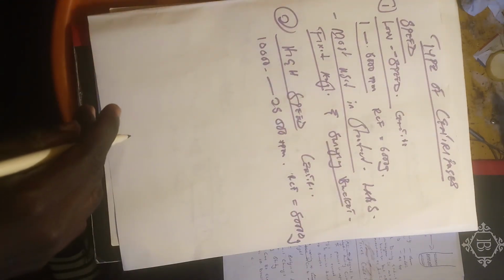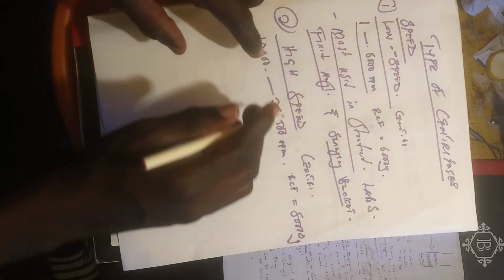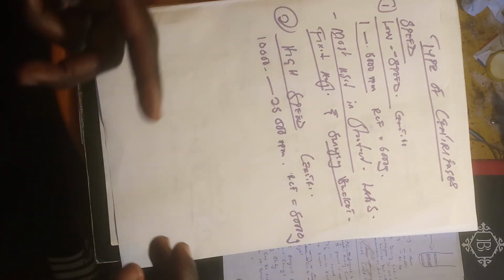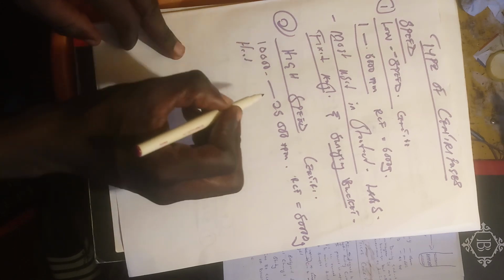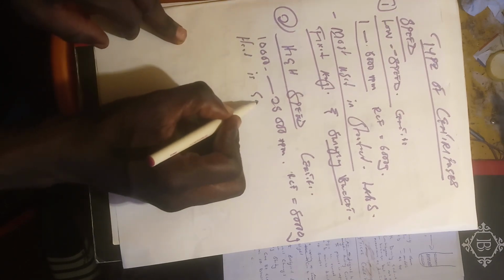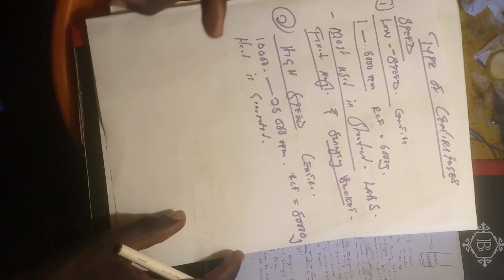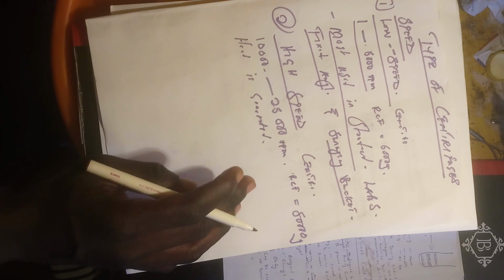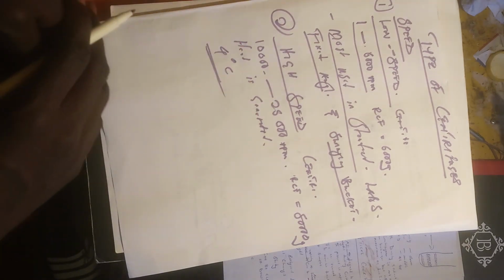Then another thing is that unlike in the low speed, in high speed, due to higher speeds of spinning or centrifugation, heat is generated. So mostly what happens is that temperature is maintained at 4 degrees Celsius. Why?